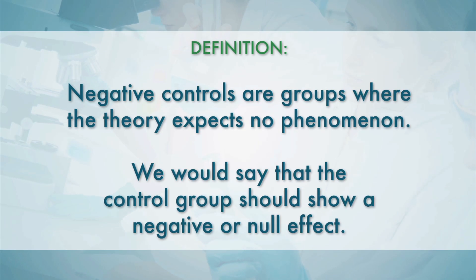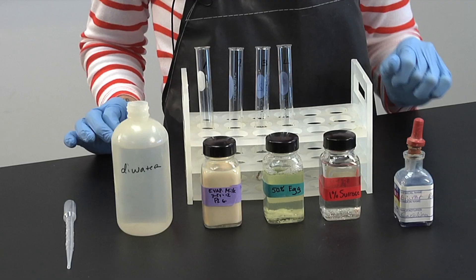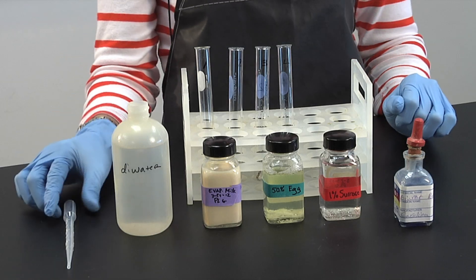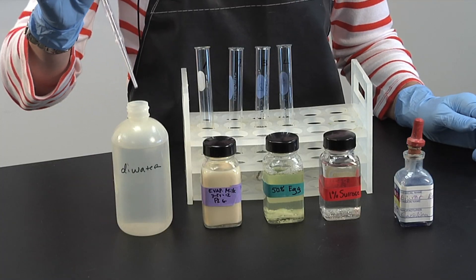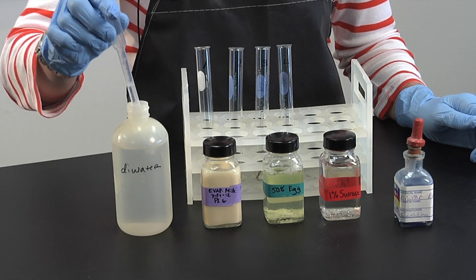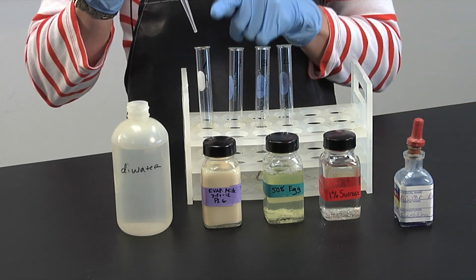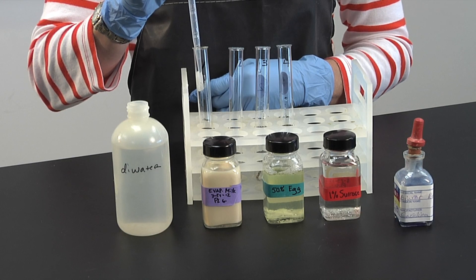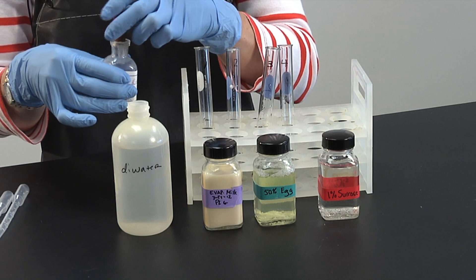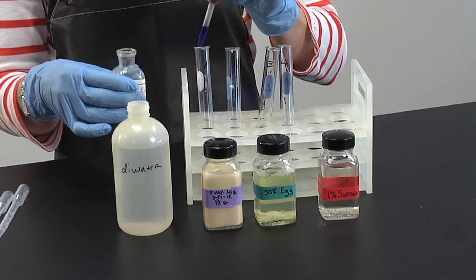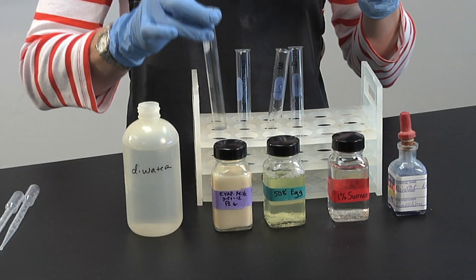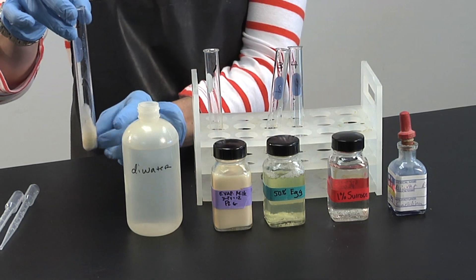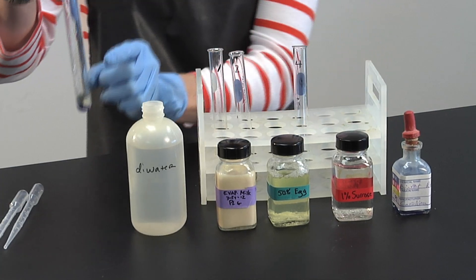Let's begin our experiment. I will first label my test tubes with a wax pencil, then add three milliliters of each substance starting with DI water. We will now add five drops of the biuret reagent to each test tube and swirl to mix. Biuret is blue in color alone. If the mixture remains blue, this indicates a negative test for protein. If the mixture turns purple or pinkish purple, this indicates a positive result and the presence of protein.